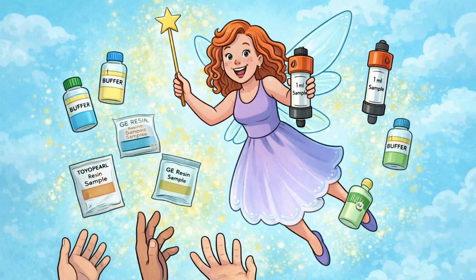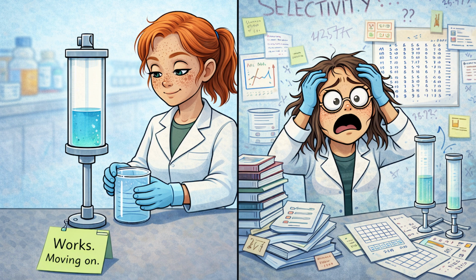But here's the good news. Vendors love giving out 1 milliliter samples. Ask, and chromatography goodies will appear like magic. Early development is not the time to reinvent resin selection. That's a phase 2 problem, when you have data, time, and a stronger emotional constitution.